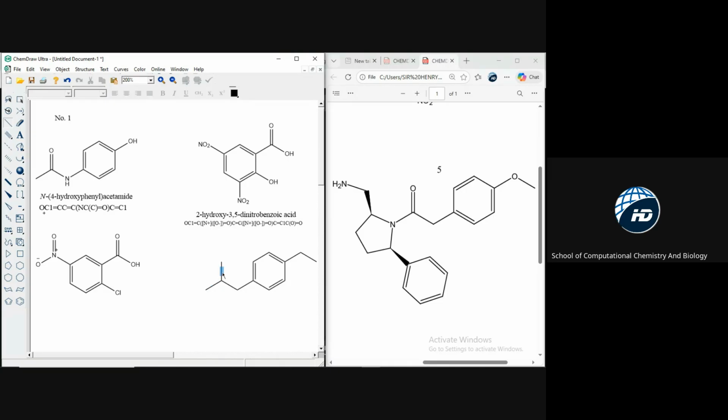If you actually look at it, it's very easy and friendly. So at this point, I will need a cyclopentane to join this terminal. This terminal, I will need a cyclopentane to join that terminal. So you can pick up cyclopentane, it is there. Come to this terminal and click. Okay, it appears like this, which is still good.